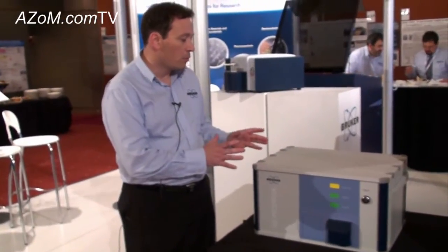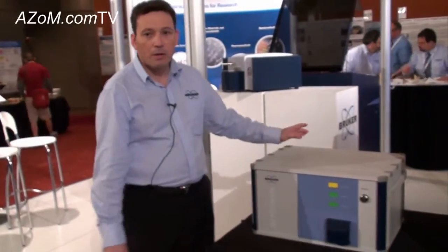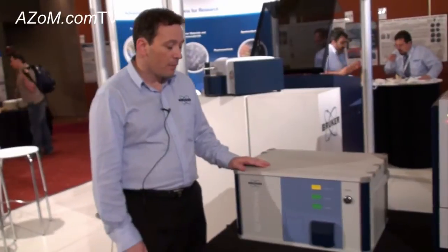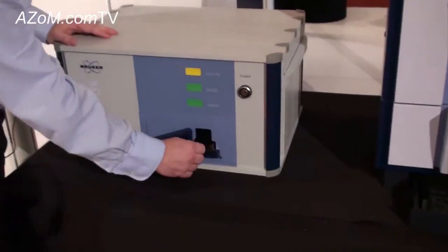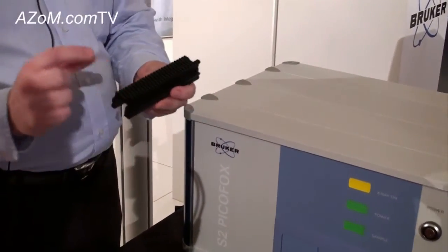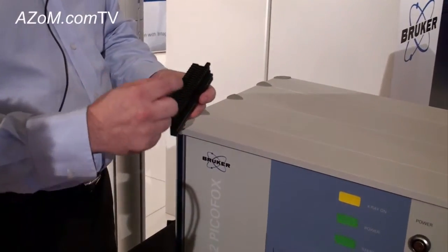It's all air-cooled, low power — no special chilling or anything required. Very easy setup. We have a sample cassette here, with little quartz discs which are placed in the instrument.